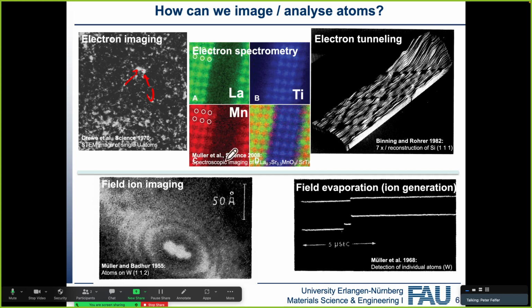This is, by the way, also some connection to me. So this is David Muller's group, and David Muller actually learned transmission electron microscopy on the same instrument as I did, because he's also a Sydney University graduate, and he was one of the first people to use the analytical electron microscope there, and I was one of the last ones because then it rained on it and it broke.